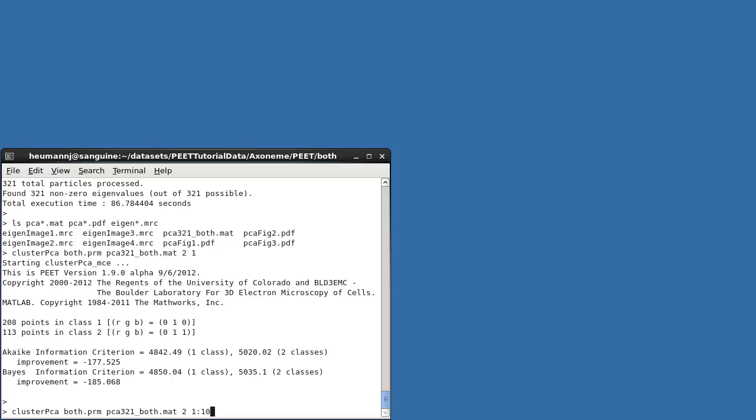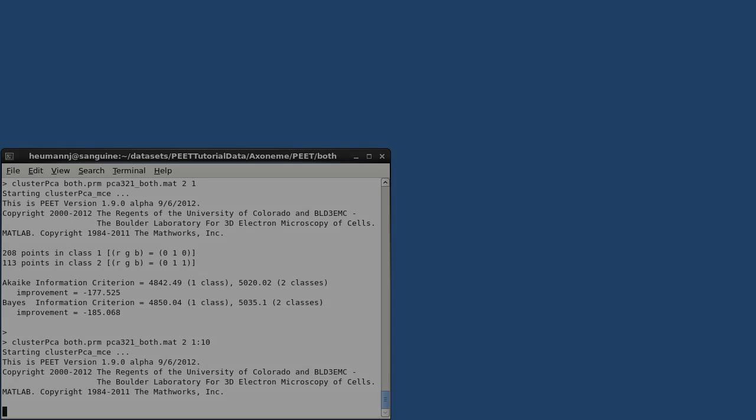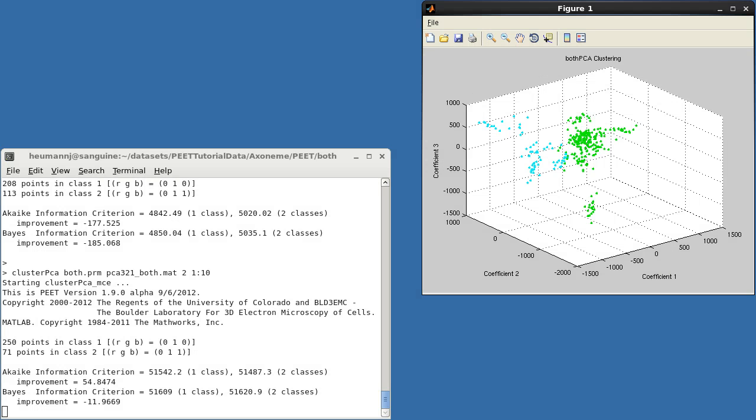Let's run clustering again with just two classes, but this time using features 1 through 10. Notice that I'm now using a colon to represent a range. You can also use commas to separate individual features or ranges. In this case, the Akaike criterion, or AIC, shows significant improvement, while the Bayes criterion, or BIC, does not. BIC is typically more stringent, requiring stronger evidence to justify a given level of model complexity.